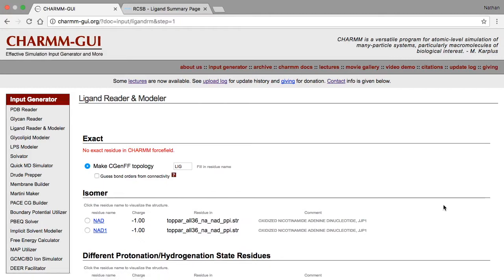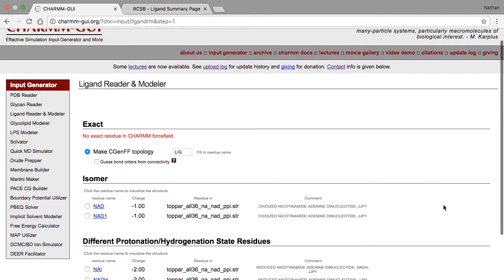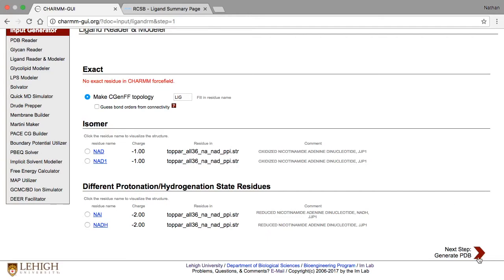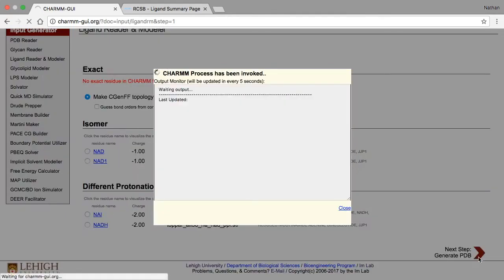In the previous examples, the section for isomers was empty, but this time, two residues show up. Both correspond to the oxidized form of NAD, with the only differences being the names used for the atoms and the residue name. When you're ready, generate the structure by clicking Next.